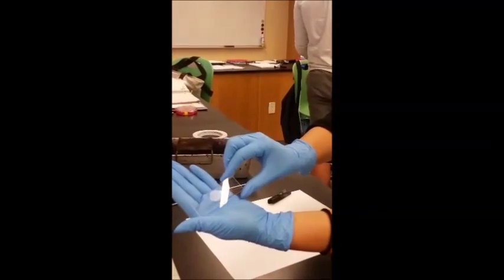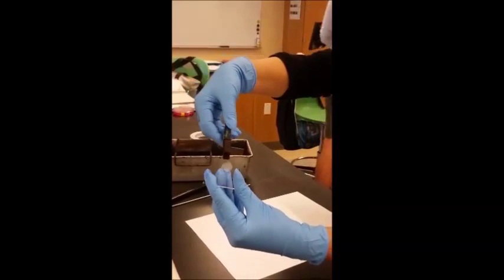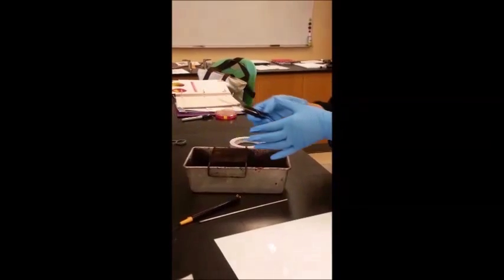Now the slide has dried. We attach the clip to it and we go for the heat fix. Just a few seconds, not too much. And then we just touch the slide to make sure it's hot enough.